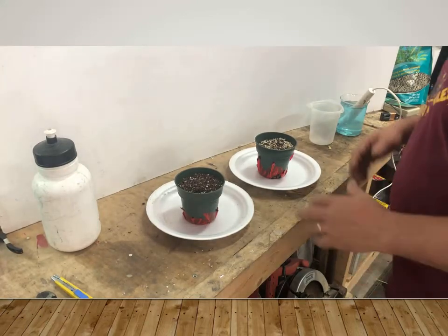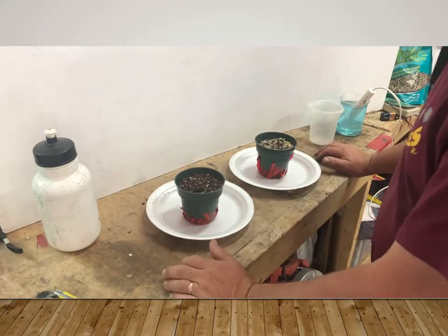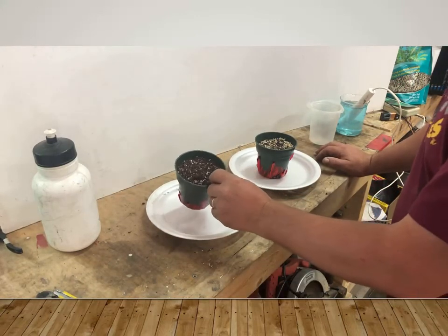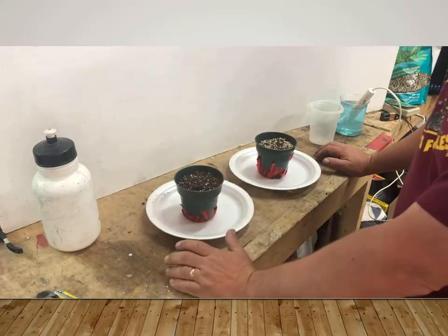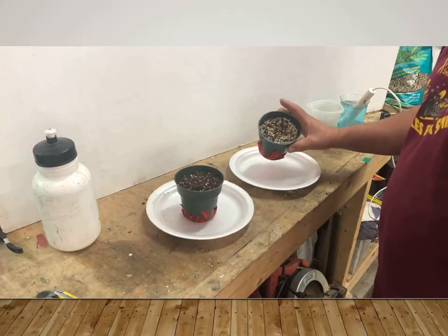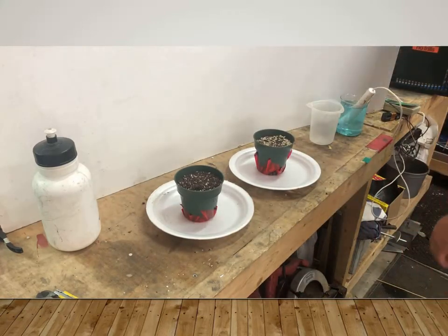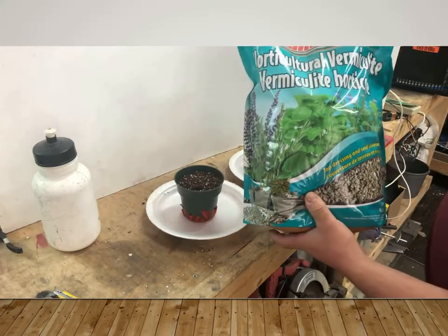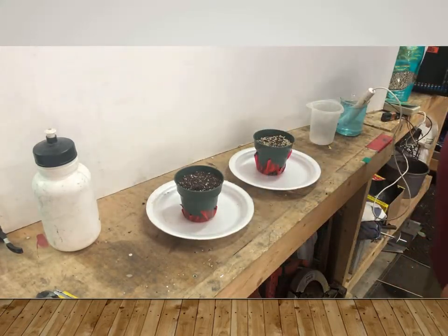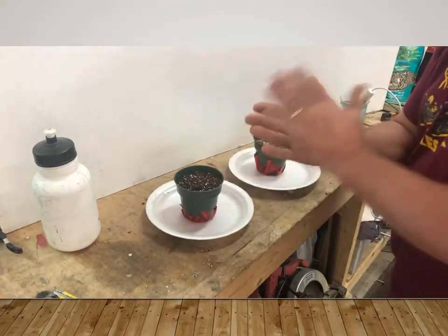Okay, so I've devised a little experiment to demonstrate cation exchange capacity. What we've done here is this is standard peat moss, your high porosity mix with a bit of perlite in it, around 20% perlite. And I've taken that and I've mixed it 50% with vermiculite. This is a bag of horticultural vermiculite bought at a garden center. If you look at vermiculite under a microscope, it looks a lot like clay. There's lots of thin layered sheets of mica.